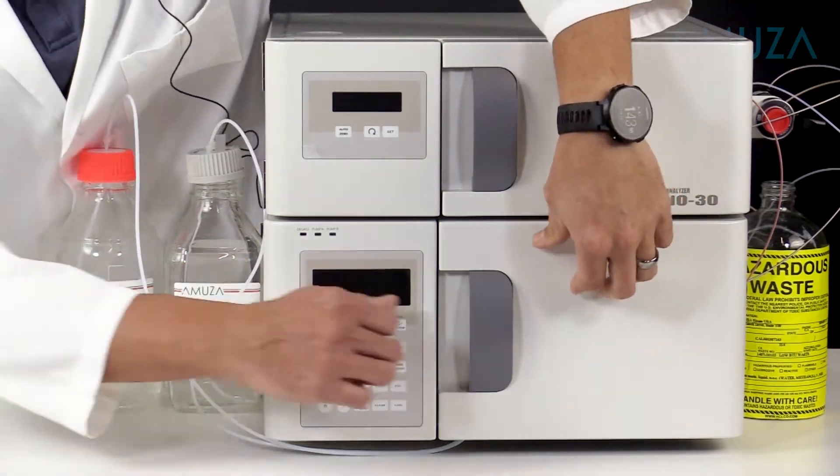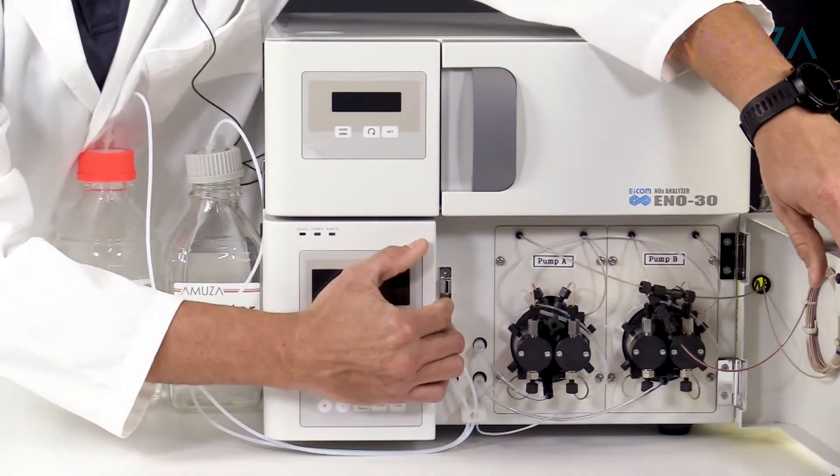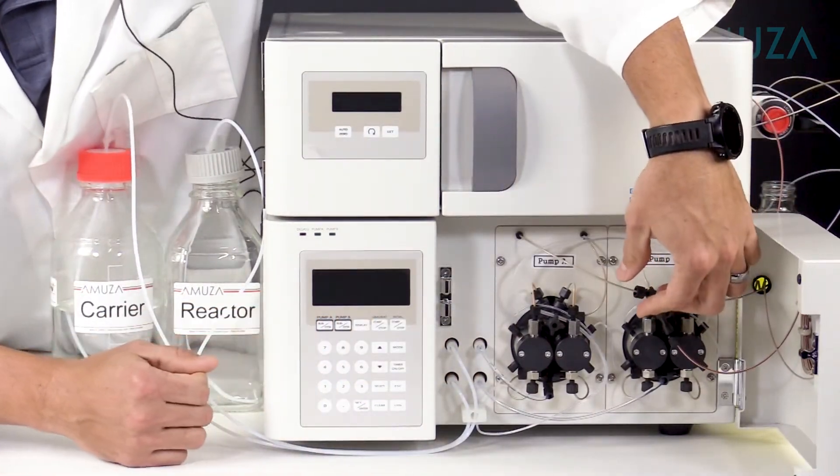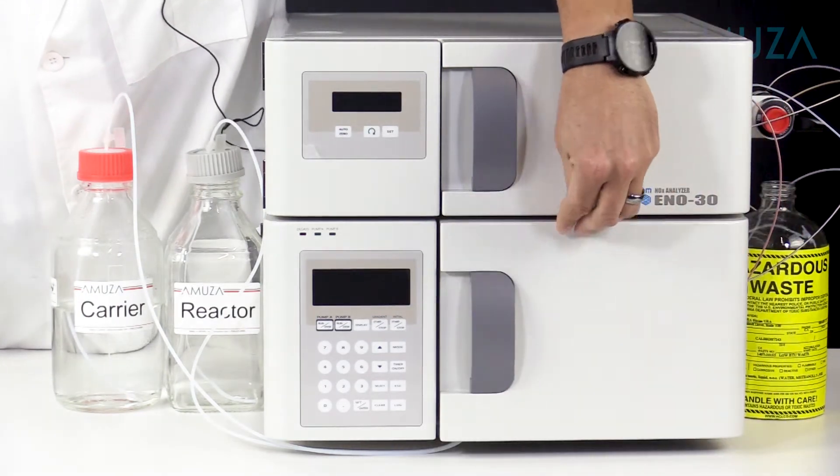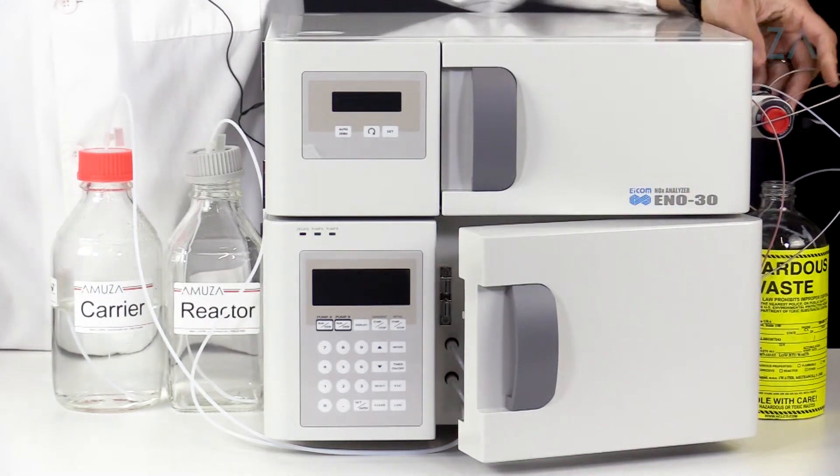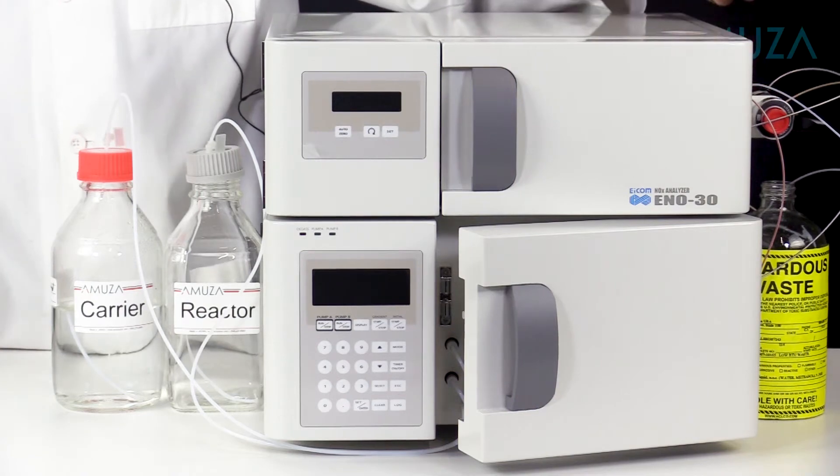The lower unit contains HPLC pumps optimized at just the right pumping speeds for proper mixing of reagents. Samples are injected with either a manual injector shown here or with an auto sampler.